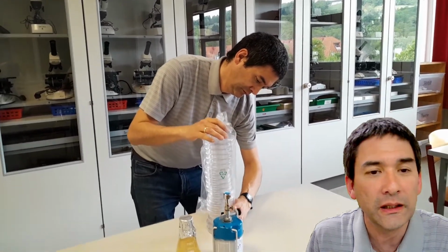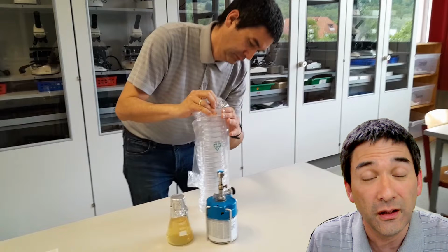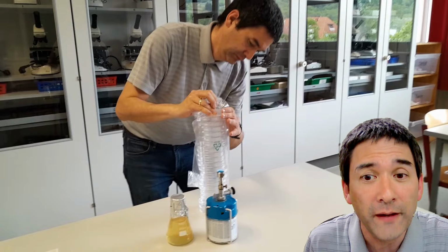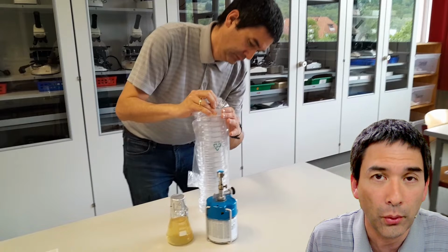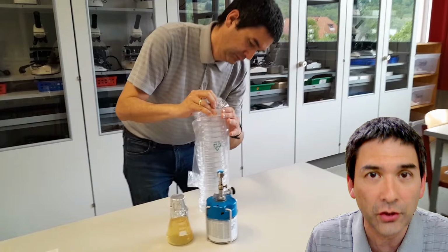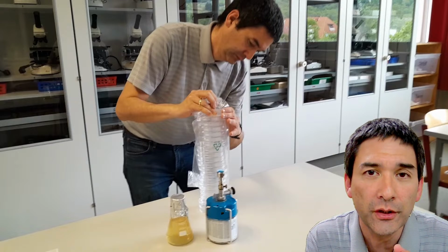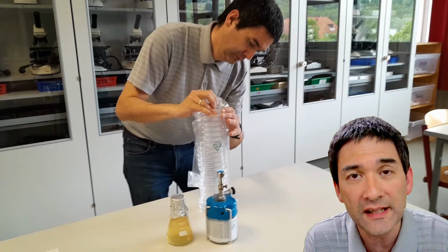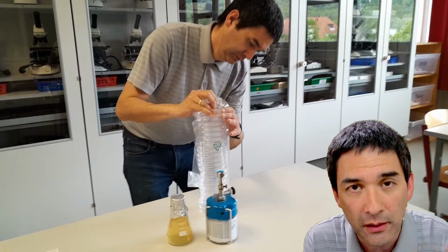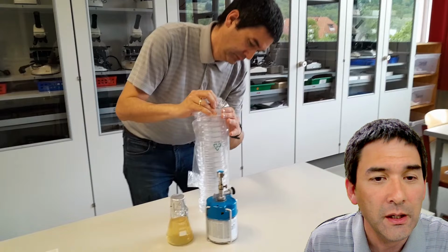Now you might wonder how the companies make them sterile and free of bacteria. They simply manufacture them, and then the whole pack, the box, is sent through a reactor and treated with radiation. This radiation will kill the bacteria. So it is sterilized after it's been packaged, and because it's sealed off, bacteria are not able to enter it. Okay, so let's move on here.